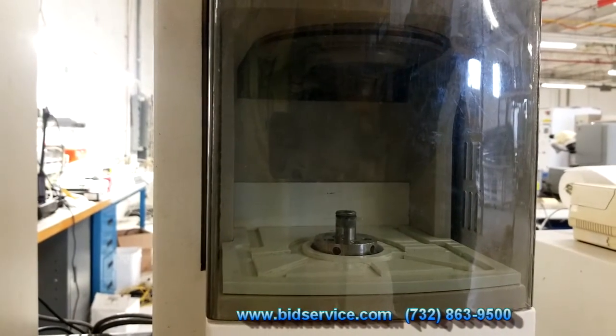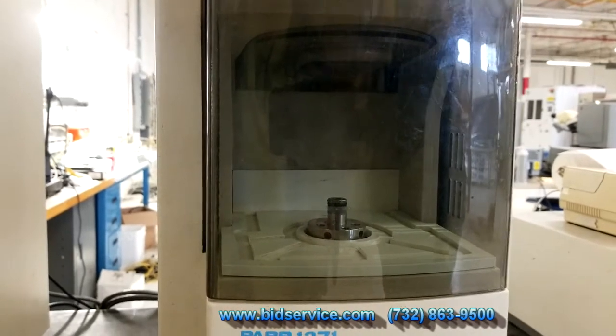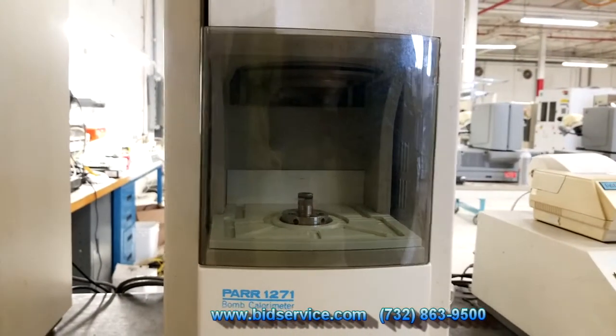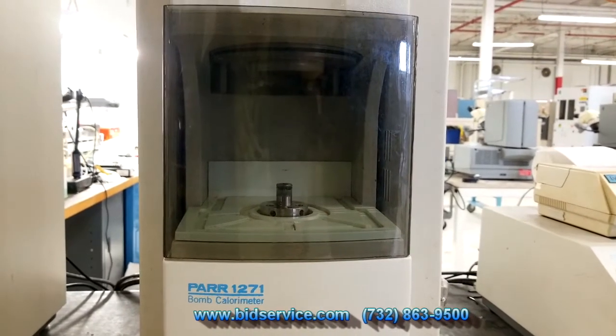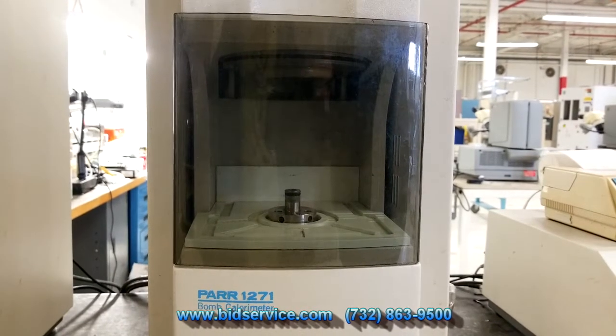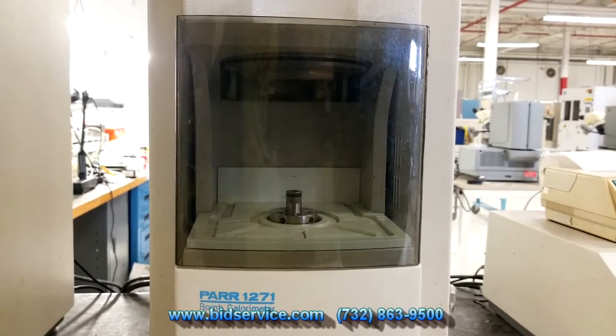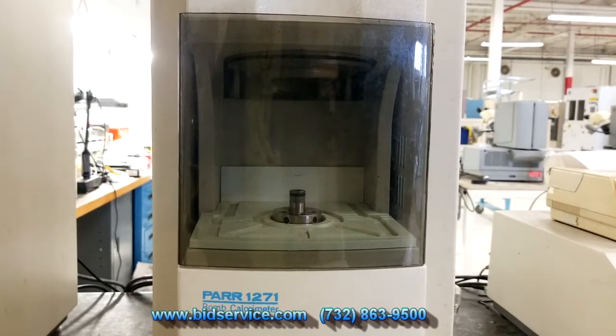So the water's coming out of the water handler system, and there's a little pump inside the bucket there. There's some noise you hear right now. So it's preparing it for the bomb process. Again, it's going to fail with the O2 not being there.